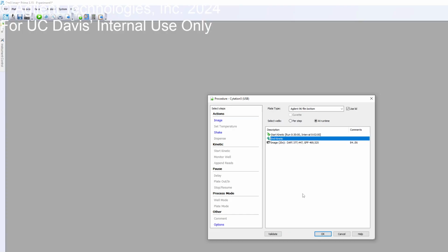So for example, you want to track a fast response in 10 minutes, where everything happens in the first 10 minutes. It's going to go to this location at a fixed manual height, or it can also autofocus if you want, and it's going to capture as many images as you want. You can actually get up to 33 frames per second. If it's that fast, you can even track that. But if you want every 2 minutes, that's also easy.